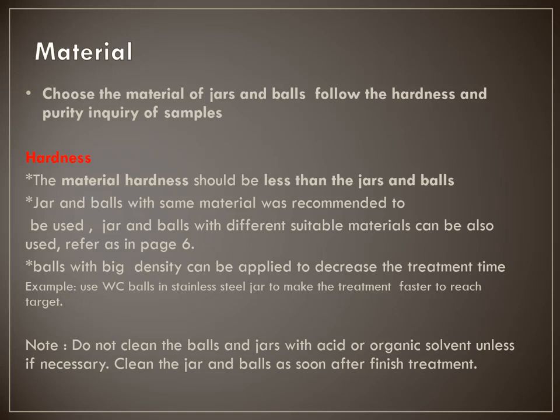Normally, we recommend you use the same material for the jars and balls, but you can also mix them, following the guide and based on your special conditions. Several jars and balls can be used mixed with different materials. You can refer to page 6.